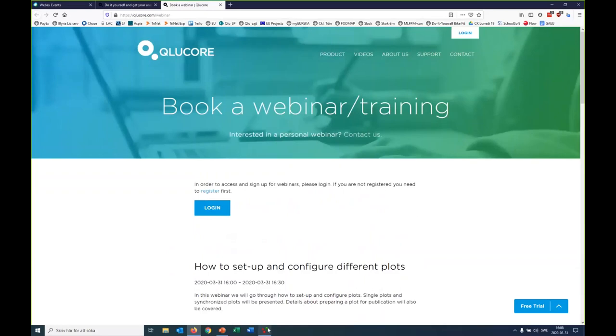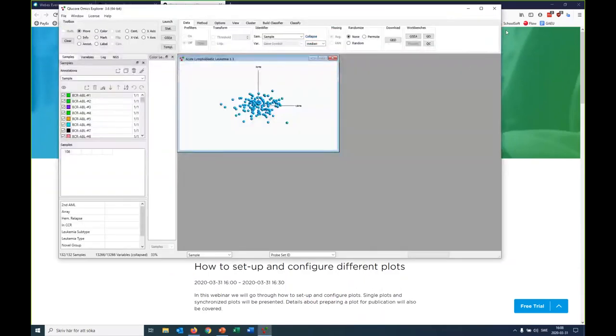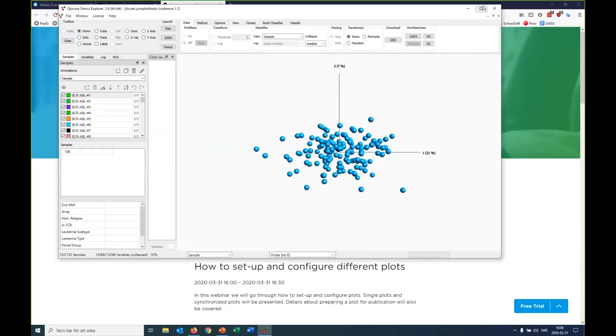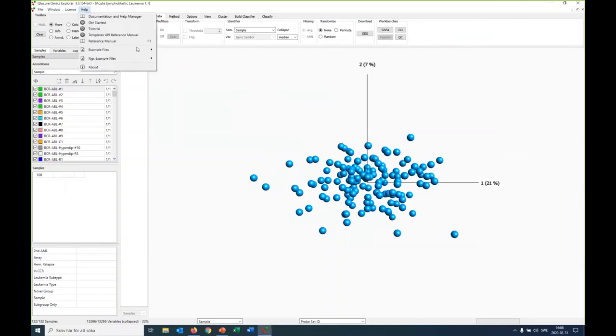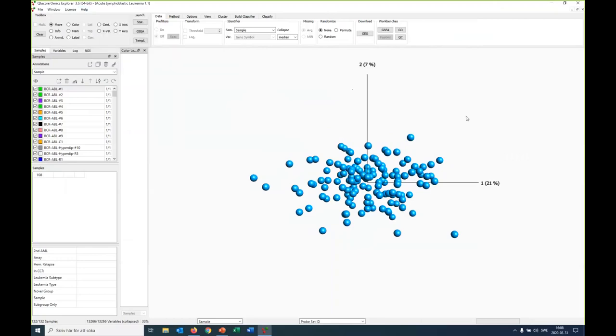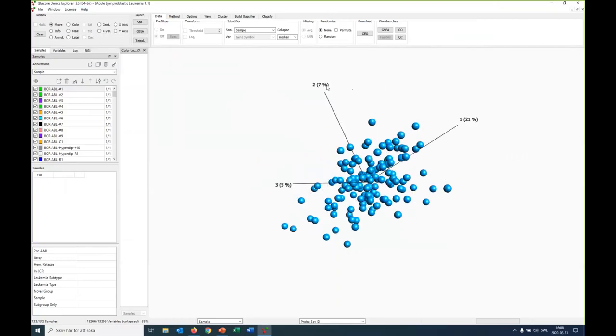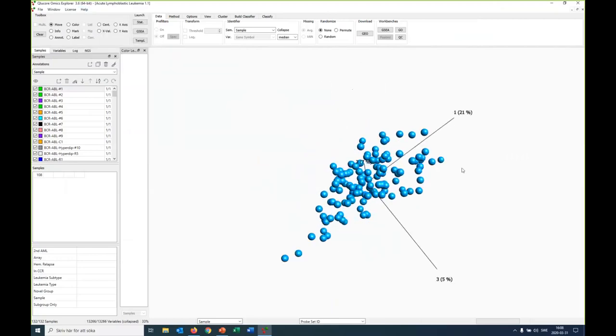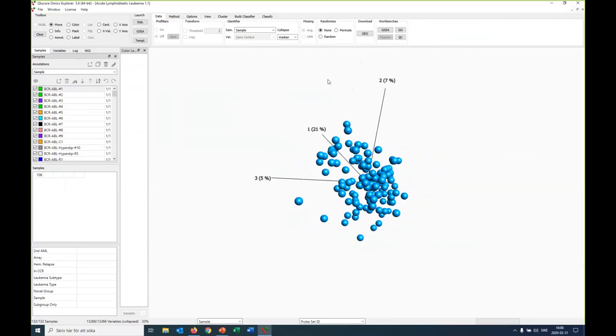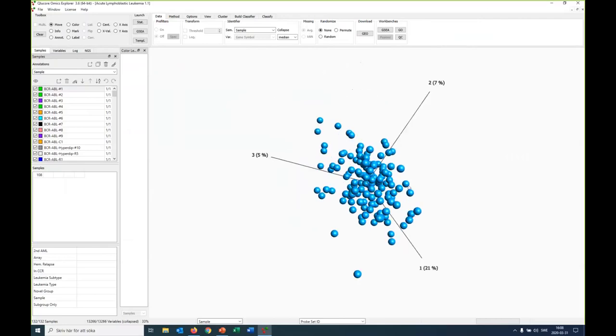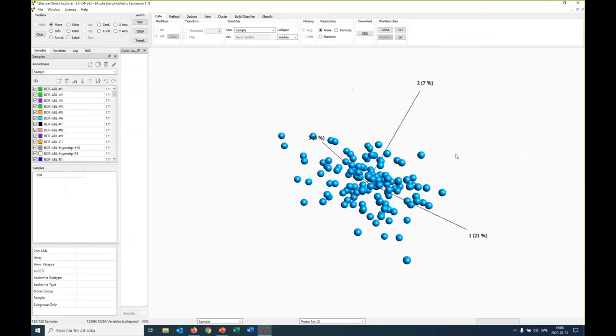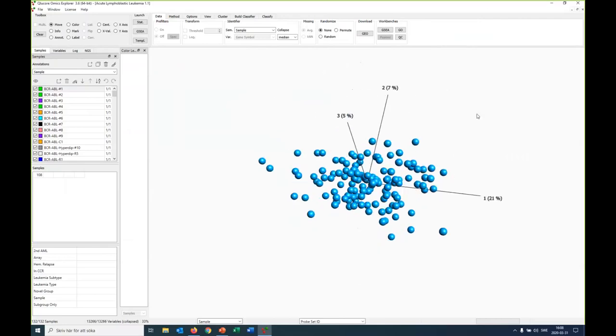Okay, let's go and have a look at the plots here. I have started the program and I will work with one of the data sets that comes with the program, the acute lymphoblastic leukemia data set. For the purpose of this demonstration today, it doesn't really matter what type of data it is. As you see here, it's 132 samples and 13,000 variables.